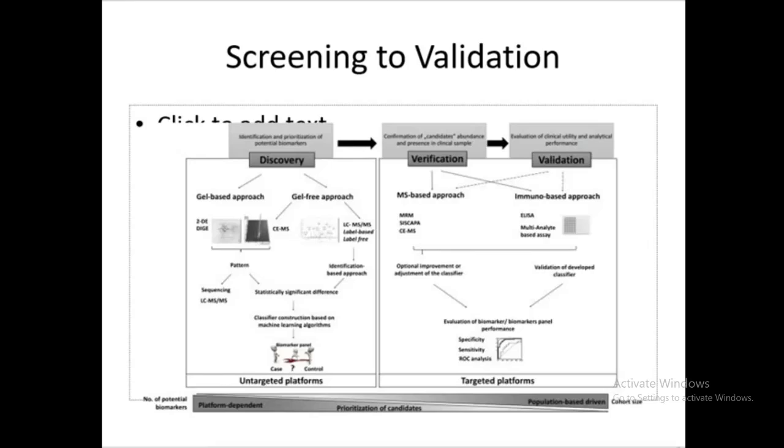Through this whole process, whether gel-based or gel-free, you identify a potential biomarker of interest, and once you've identified it, you can take it forward to verification and validation.